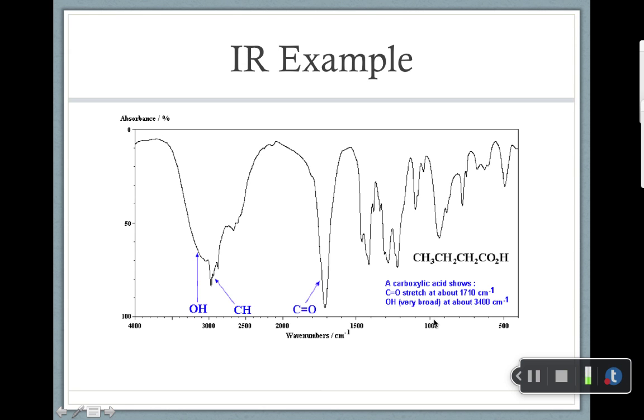The other thing you need to do is give your analysis of whether or not this was successful. So if you see peaks that you wouldn't expect to see, explain that. If you don't see peaks that you would expect to see, say that.